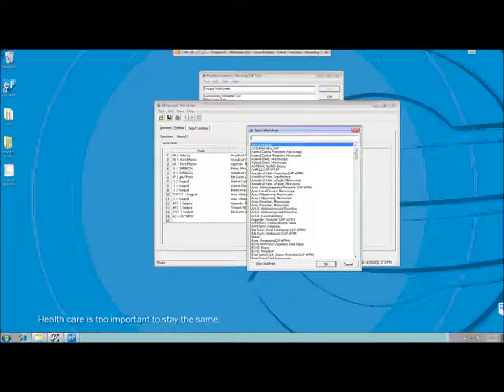So to differentiate between the PowerNote and mTuitive worksheets, we have added the CAP EFRM at the end of the worksheet names. So these ones are the mTuitive ones. And then since we already have the PowerNote stuff set up in the domain, you'll also see the ones without the CAP EFRM at the end. Those would be the PowerNote worksheets that you're currently using. So it is possible for you to use both mTuitive and PowerNote at the same time within the same environment.